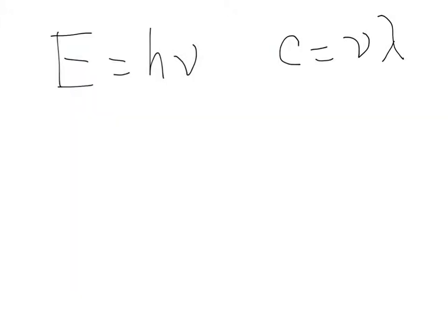Hopefully we got that down. And like I said, we will go back over the introductory part where I have it listed and we review what E equals h nu and c equals lambda nu mean. But the important thing here is that each of those wavelength ranges gives you a little bit different information.